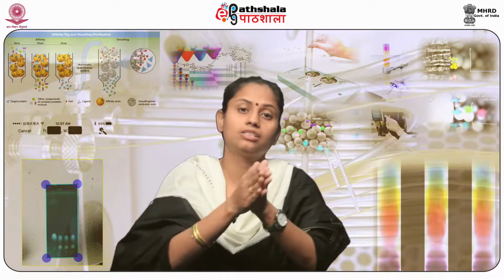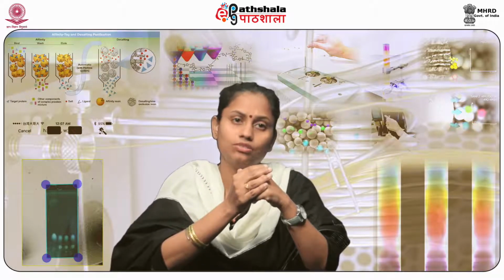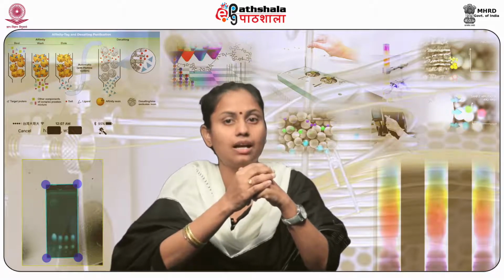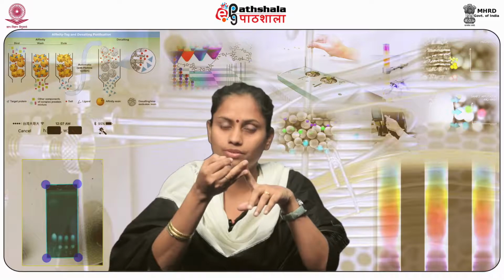Now, we should know how to go about optimizing an ion exchange chromatograph to obtain optimum results. The various factors or substances that play a critical role in carrying out the purification procedure in ion exchange chromatography are pH, buffers, salts, detergents, zwitterions, organic solvents, and temperature.